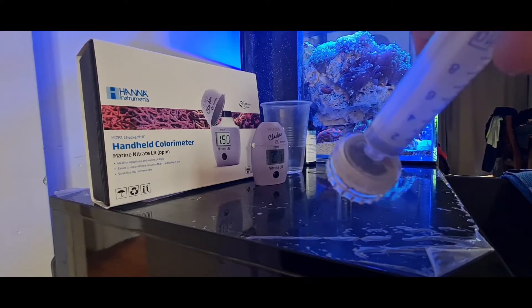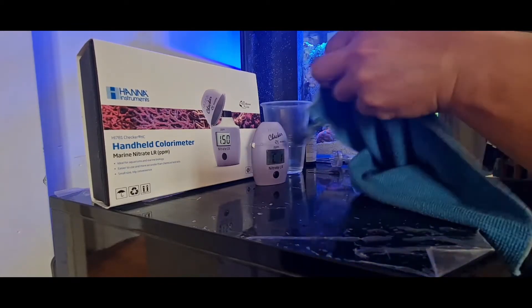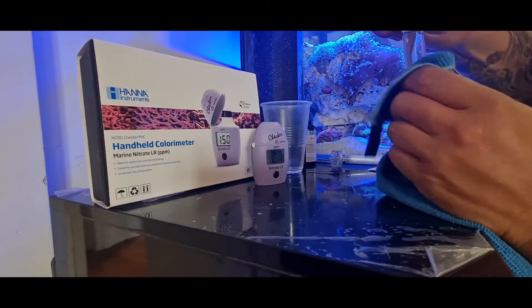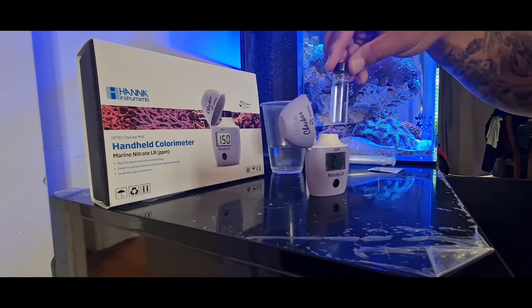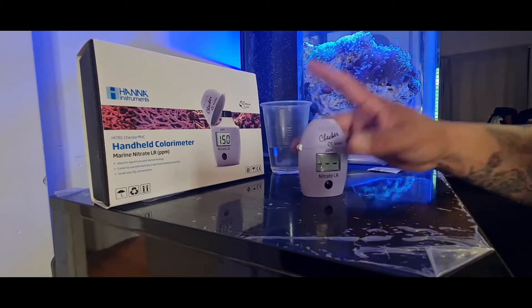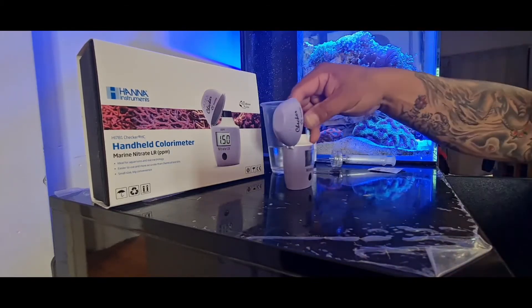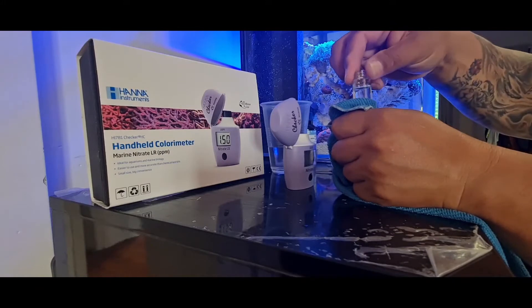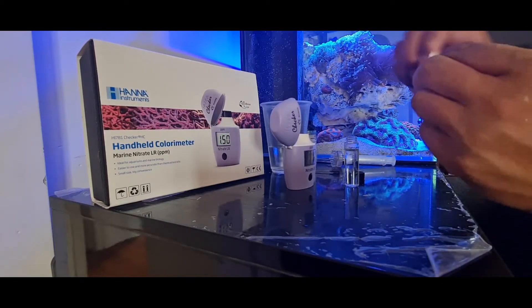You can see all that dirt in there — that's what we just filtered out. Put the lid on and rub all the fingerprints off it. Get the checker. I like to put the 10mm mark at the front so I know to insert it the same way each time. Press the button and it will bring up the reagent blank reading. Pull it back out again. Try not to touch it — don't get any more fingerprints on it. Then get your reagent C.